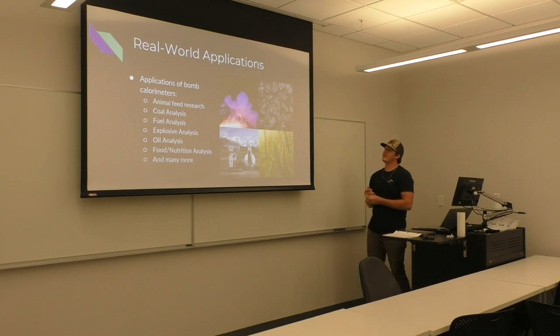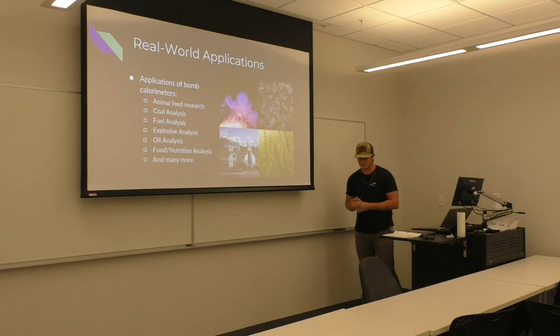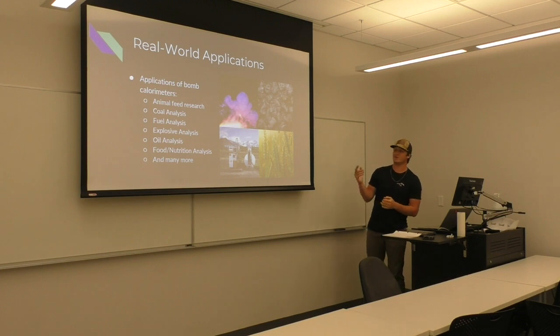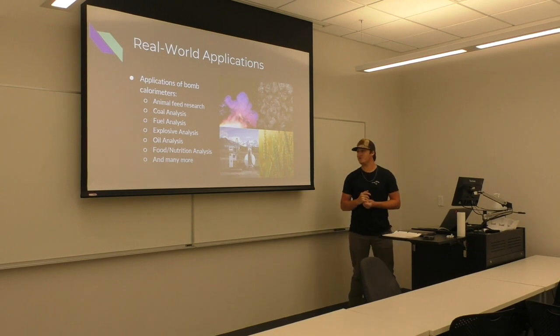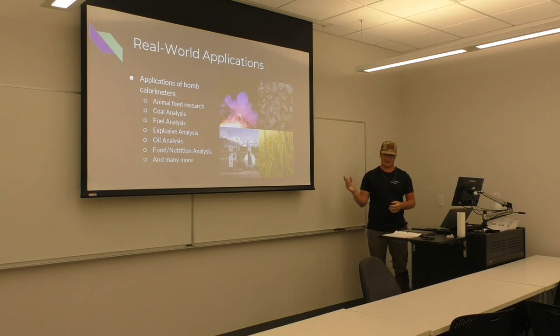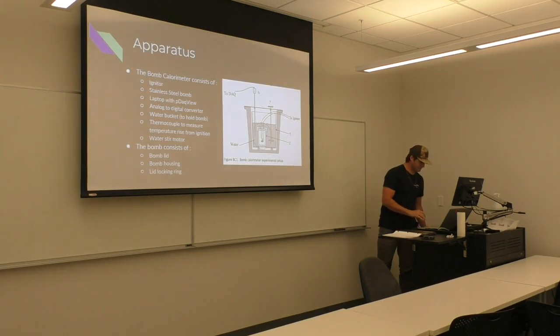Some real world applications. It's used in many industries to do analysis, such as in the coal industry, explosives like fireworks and stuff like that, oil and gas, food and nutrition. It's used all the time to just do constant analysis on how heat affects these different things.